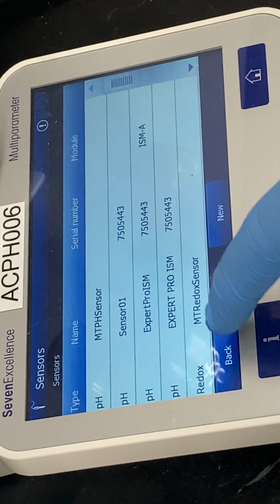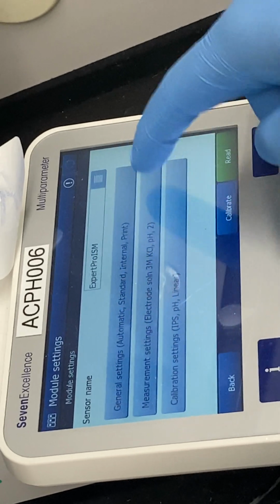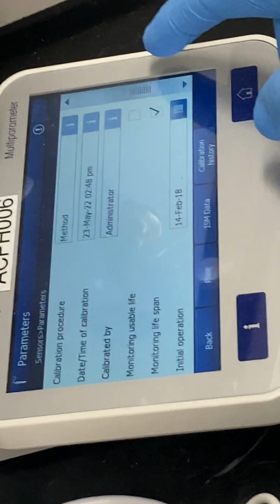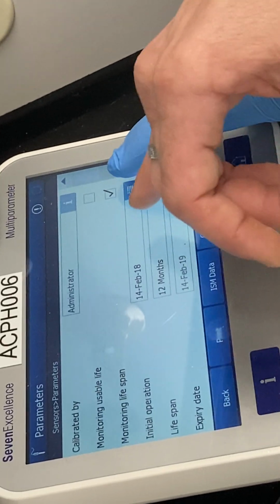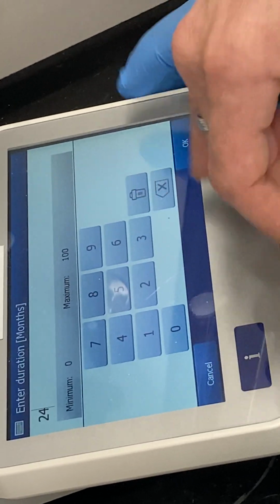So the one that is being used, that says it's expired, is actually that one. Which is kind of odd. Right there, expiration. Yeah, let's just go 12 months and change it. But couldn't we have done that for the last one? Well, that's what. Yeah.